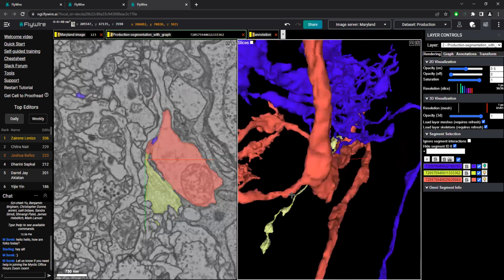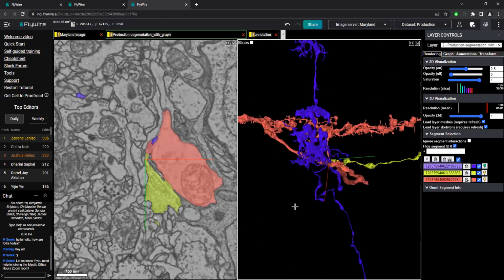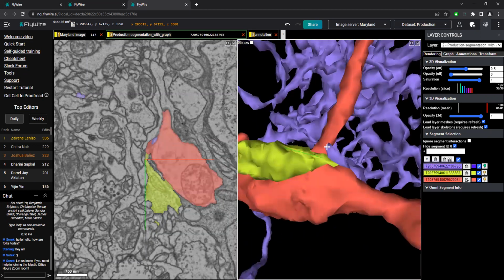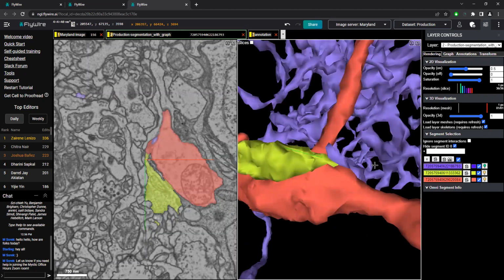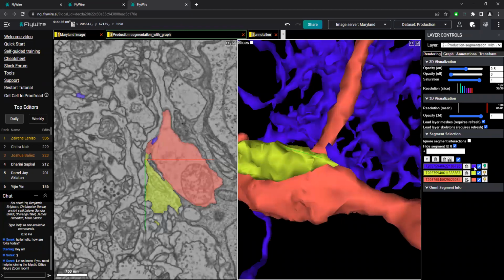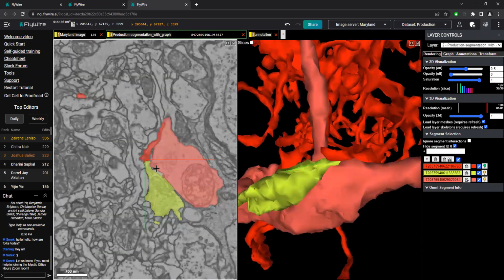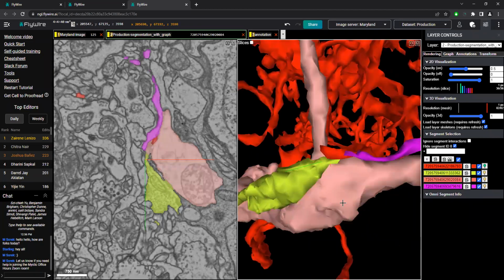But when we look at it in the overall structure, that definitely doesn't fit with the rest of this clump here. It comes out way too wide. And if we look in 3D, this is going up this way, and it feels like it should be going across to the right. So let's continue adding pieces by elimination. I'm going to turn this other blue piece red. I know it doesn't belong, but I've added it in. Let's see what's going on with this neighbor piece here.